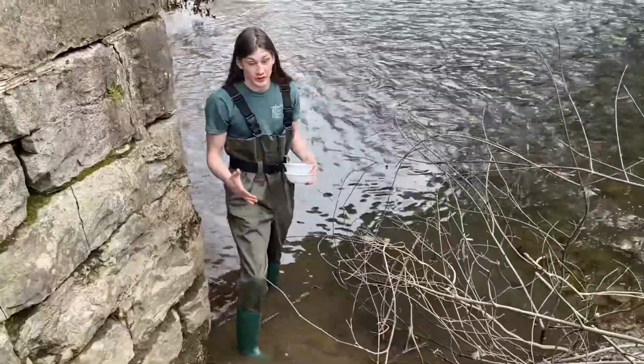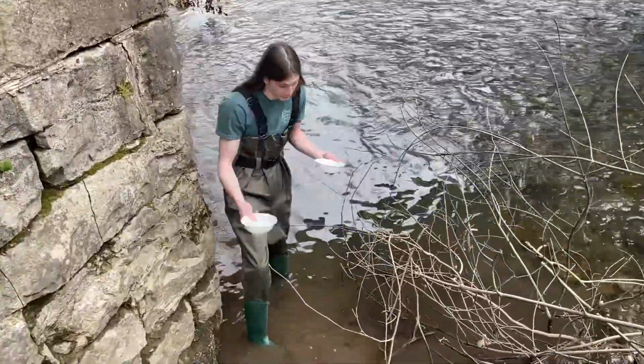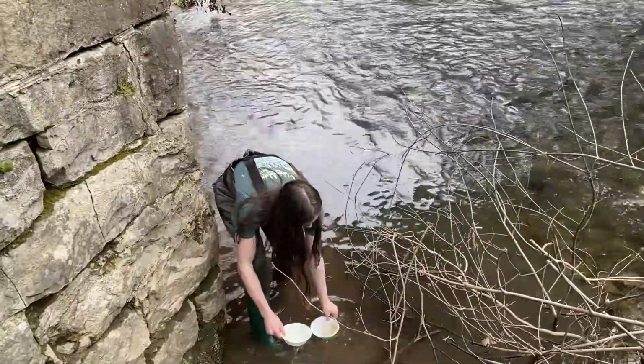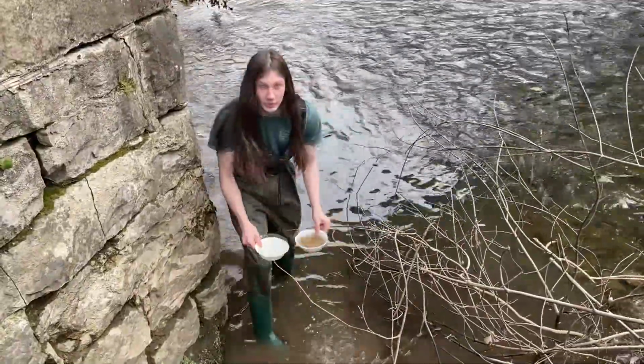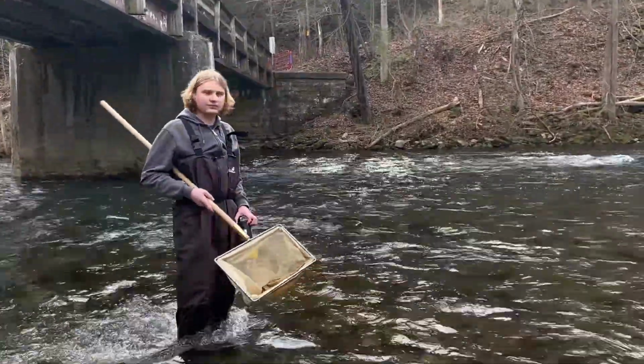Okay, so the first thing you're going to do, once you have all of your tools and equipment ready, is take your two bowls and fill them with water so that you have a place to put your benthic macroinvertebrates once you collect them. Now that we've determined our site, it is time to begin the sampling process.